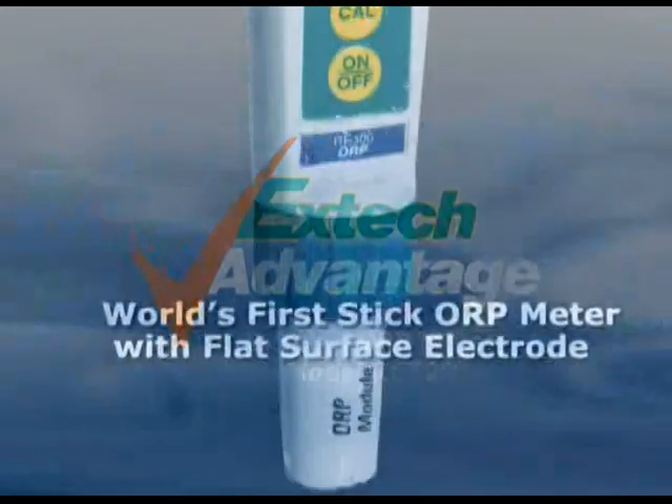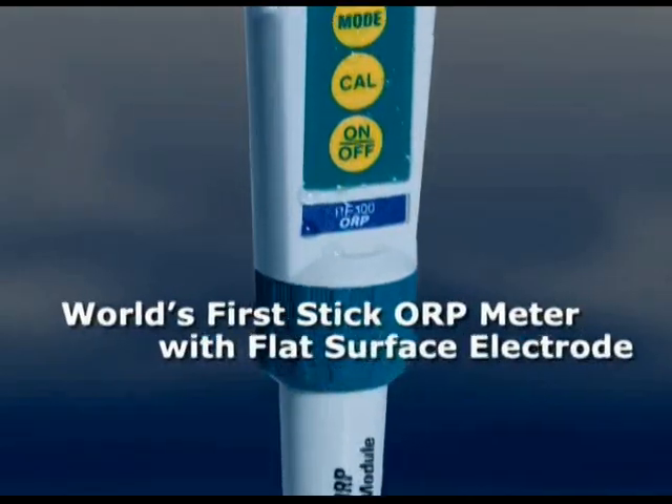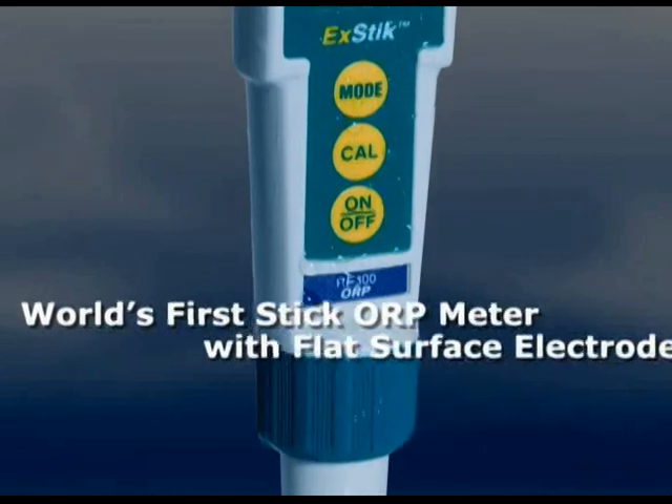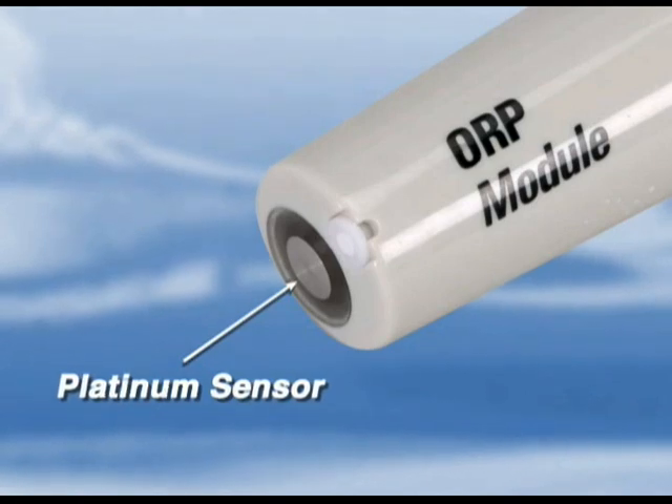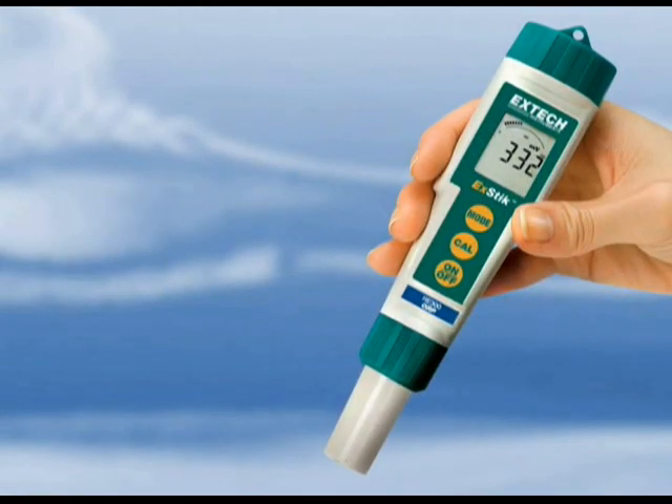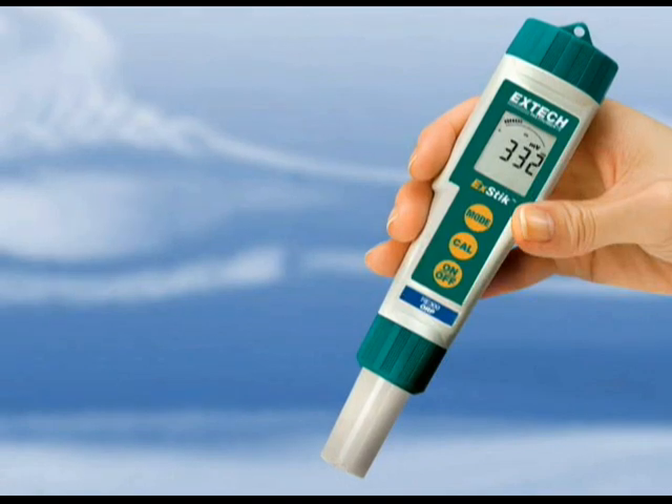Presenting the world's first ORP stick meter designed with a flat surface electrode. The XDIC ORP meter utilizes a platinum electrode with a built-in reference to provide high accuracy reading of the potential difference measured in a water-based sample. What sets this meter apart from your traditional ORP stick meter?